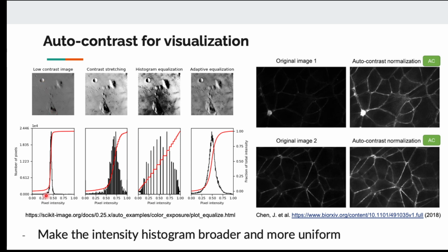So when you plot the histogram, it's going to look like this. You have a very high frequency of pixels with the same color, and you have very few pixels with dark or light color. This is a bad histogram, because when all the pixels are the same color, you wouldn't see much of a change, because everything looks the same.